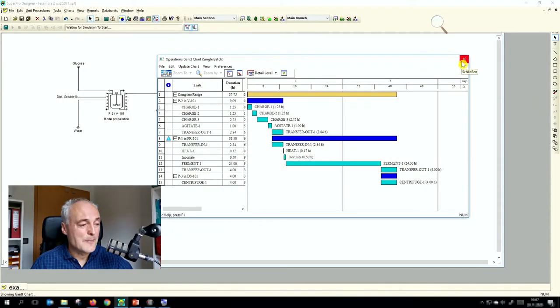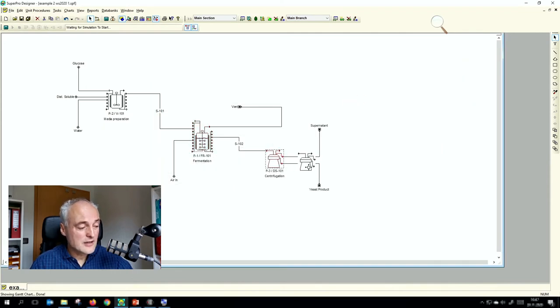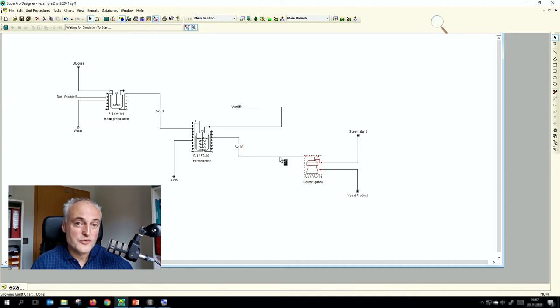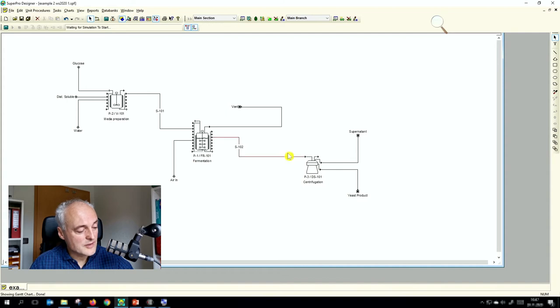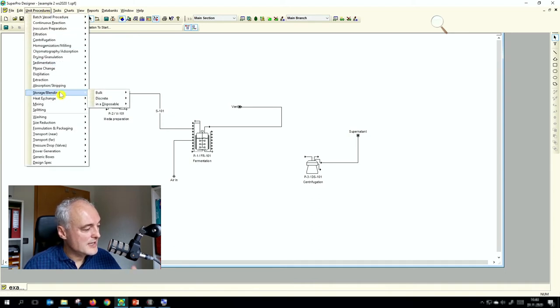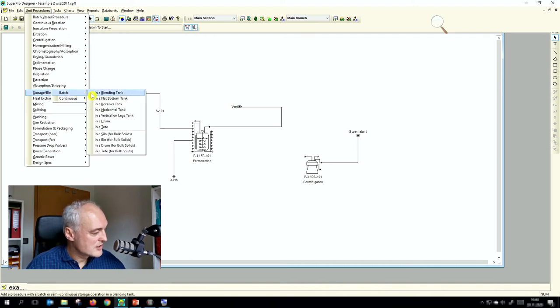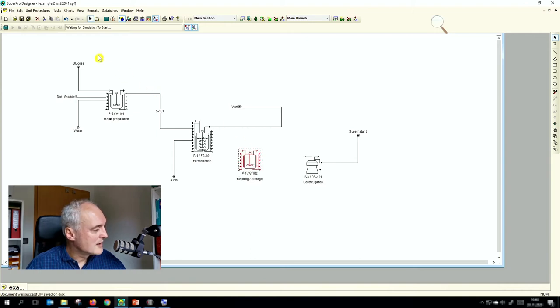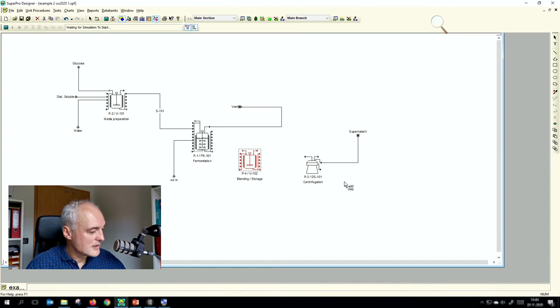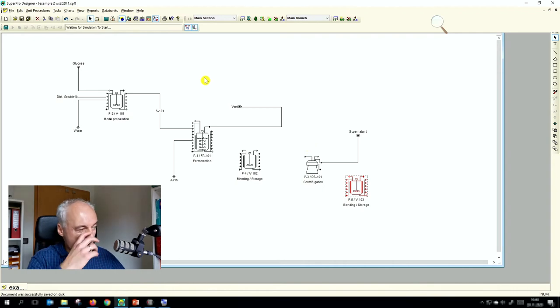We now add blending tanks. We add a storage/blending tank in between for transfer and another blending tank at the end for product collection. In SuperPro Designer: Unit Procedure → Storage/Blending → Bulk Batch → Blending Tank, one here and one here.